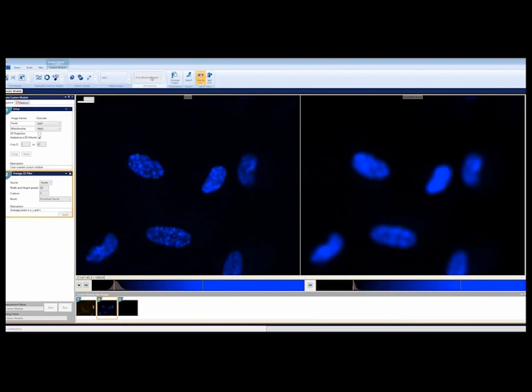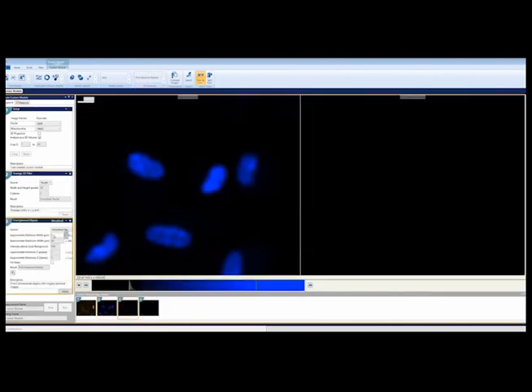With the nuclei smooth, it is time to segment. Again, we will use a 3D tool. This one is designed to find spherical objects. It is capable of finding things a little more complex than spheroids, but generally is good for things where the centroid remains roughly the same from plane to plane. This is one of 2 step cards designed for 3D segmentation. The other, Find Fast 3D Objects, allows some rougher shapes, but Find Spherical Objects does a better job of finding bunched together things sitting on top of each other.